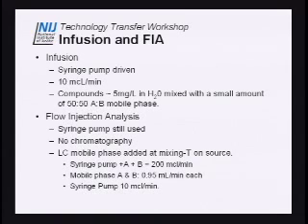I'm sorry, it was water with just a little bit of mobile phase in there. I put the mobile phase in there to make it slightly acidic to promote ionization, so that I would get a nice strong signal. For flow injection analysis, the syringe was still there, pumping, but then I also added through that little T. You see the little union where you tighten in the LC effluent to the source? You can actually take that T out there and put a union that will allow you to T in the flow from the LC as well. And so what you're going to see is the difference between infusion and flow injection, or what is the difference between just infusing the drug and then having the drug come out with your mobile phase, because they're going to be different, and you're going to see how different they can really be.